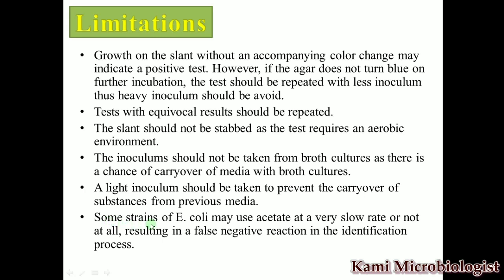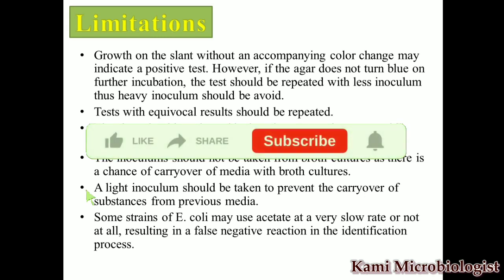Next point says that there are many E. coli strains, and there are some strains of E. coli that can use the acetate slowly, and because of this we get a false negative result. So you have to be very careful. Although the result will be negative, it is actually positive. Why? Because E. coli is present, but it is utilizing the acetate slowly. So there are some strains like that.